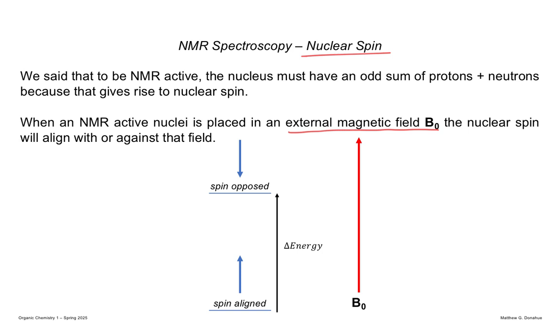And you can't see it obviously, but, do you know what a torus is? The shape called a torus or a donut. You like Shipley's or Krispy Kreme, just like a normal donut. That's what the magnetic field is. It's like these opposing sort of circles that run in 3 dimensions. So that's the magnetic field. The nuclei themselves, when they spin, they generate a tiny magnetic field. And that's what's shown here as these blue arrows.